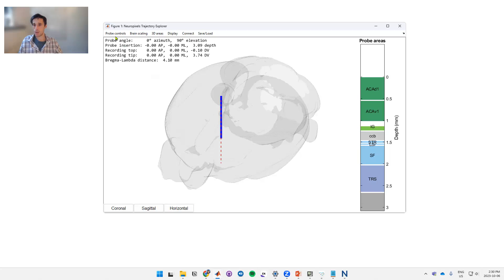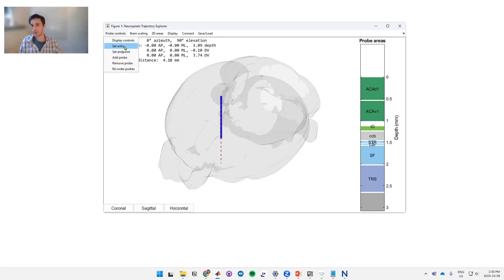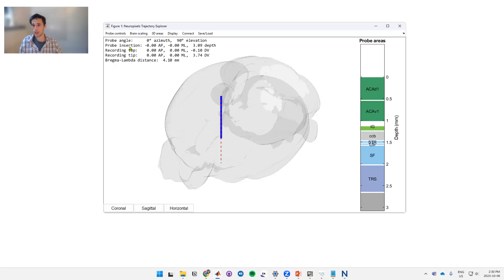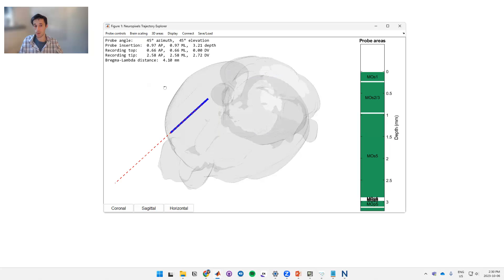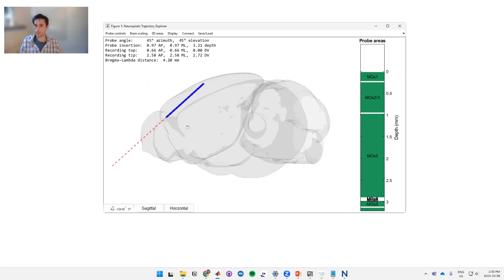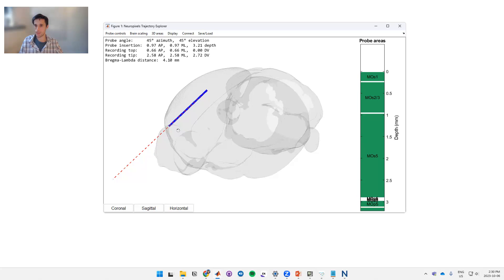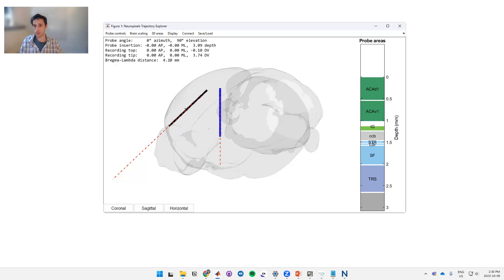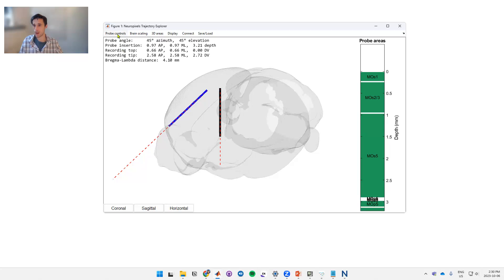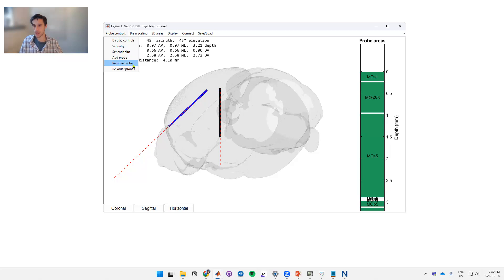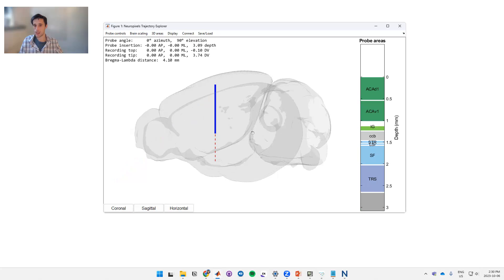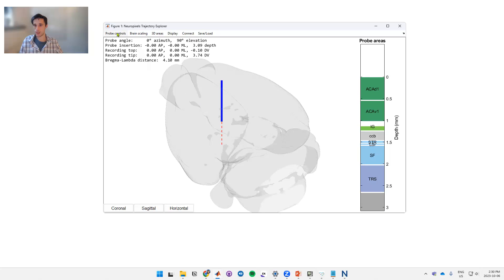I'll take you through the general controls up here and what they all do. First of all, if you hit probe controls then we have a list of options for setting our probes. For example, if we know where our probe is going to go we can hit set entry and we can type in coordinates and it moves the probe to that particular position. We can add and remove probes if we want more than one, so in this case we can add a new probe. If we want to get rid of a probe we can click on it and hit remove. Okay, so these are the general probe controls.